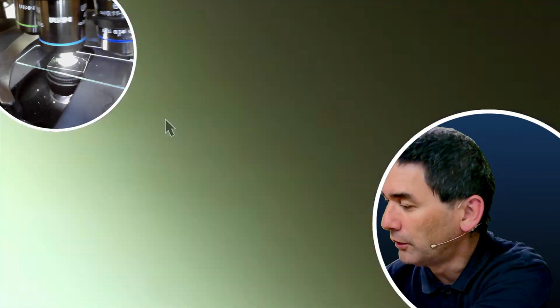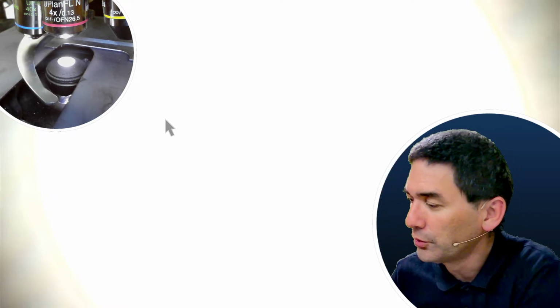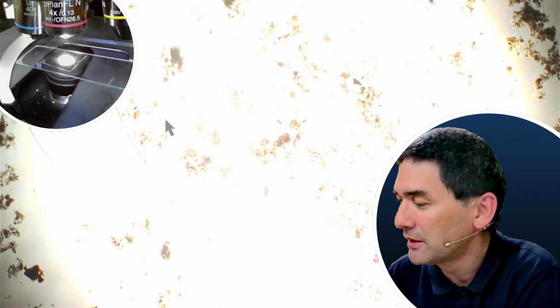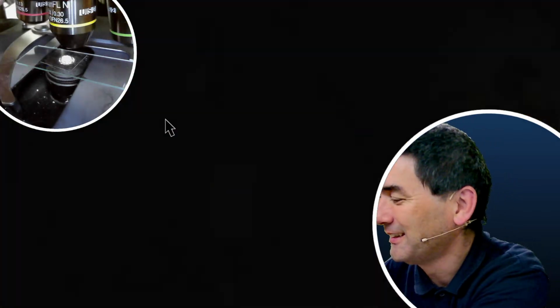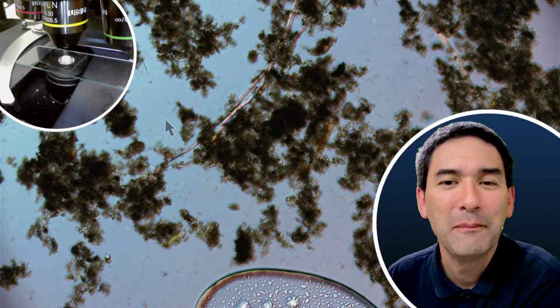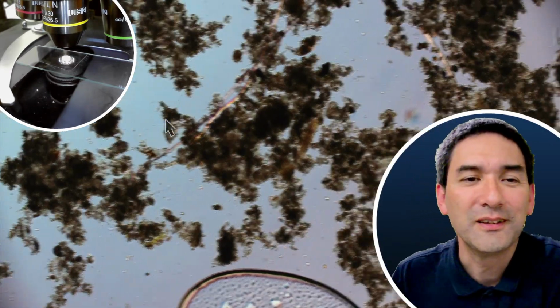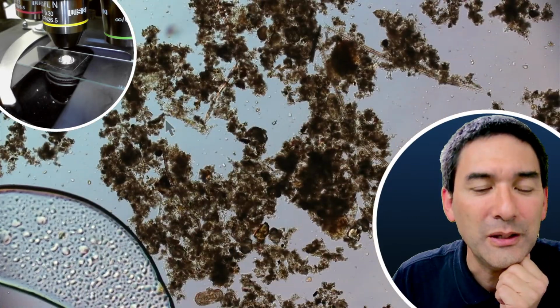Basically I started off this session by putting a specimen from glacial snow under the microscope. I ended up somehow showing you a couple of worms, some sand and some other things here. So let's put the glacial snow under the microscope again here. And you see that there is a huge difference in what you're able to find.